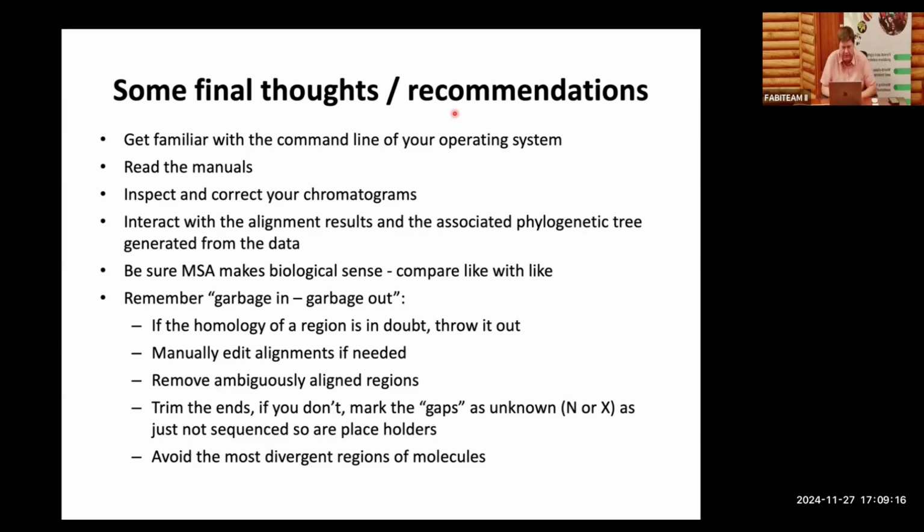If you have very divergent taxa, so taxa that are very distant to each other, you will have problems in your alignment, but that's true for your markers as well. So if we take ITS and we use that to generate a phylogeny over families, you are going to struggle to get proper alignments. So in that case, we will not use ITS. And the same goes with your introns.